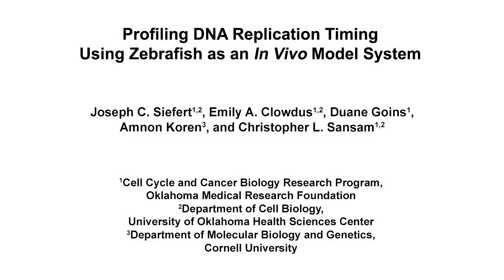The overall goal of this procedure is to generate whole genome DNA replication timing maps from zebrafish embryos in different stages of development. This method can help answer key questions in the cell cycle and chromatin biology fields, such as how chromatin changes that occur during embryonic development can affect the initiation of DNA replication forks.